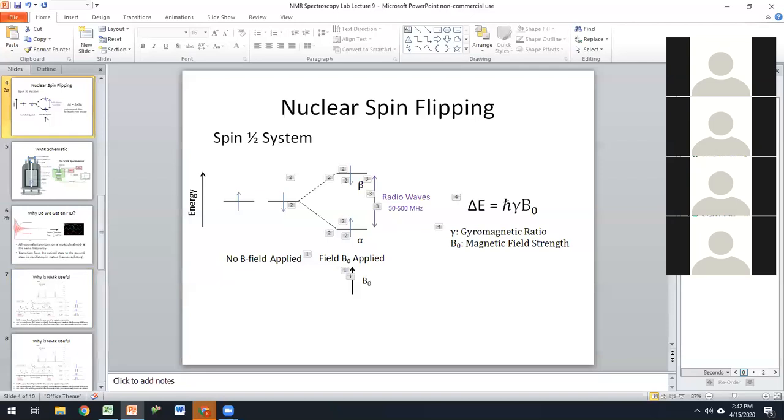One of them I already gave away in this slide: spin 1/2 is better for this sort of thing.